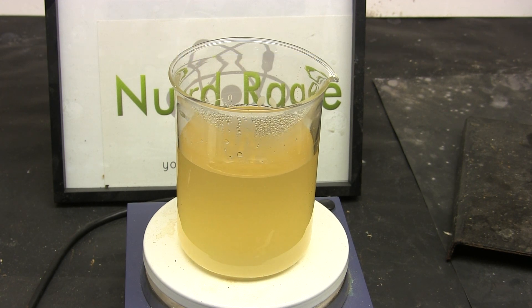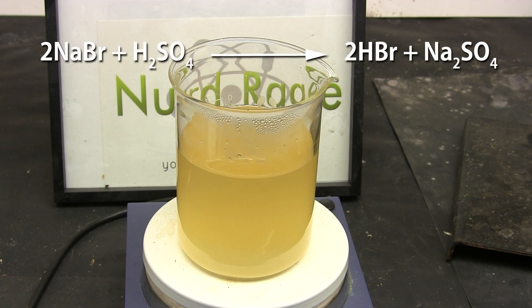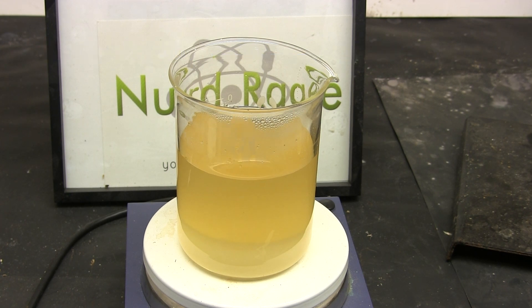Most lab manuals and chemistry resources on the internet specify the use of sulfuric acid rather than sodium bisulfate. You can do this if you want, but I'm going to assume that sodium bisulfate is much more readily available to you.